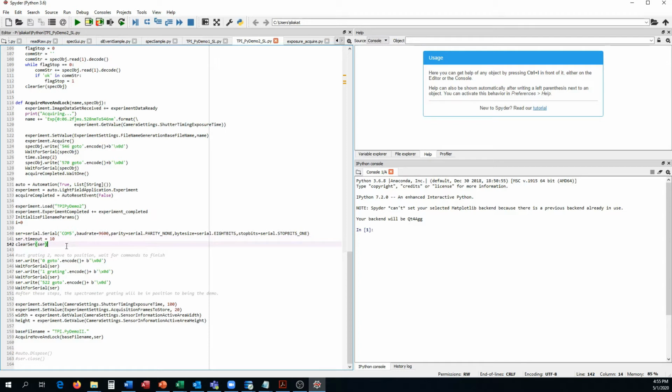And since I'm going to be doing some real-time captures and using some motion to do it, I didn't want that here. So I'm going to control it through the serial port, and you'll see how we combine this with the asynchronous acquire and get some moving data, if you will.